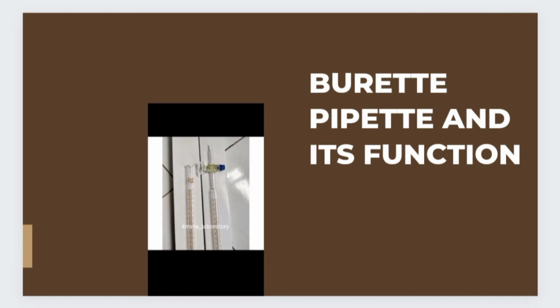The burette serves to drip a number of liquid reagents in experiments which of course require precision, such as titration experiments. The measurements of the burette are very accurate, even when compared to a measuring cup or a dropper. A Class A burette has the highest accuracy. The ability of this burette is very important to have and to use.